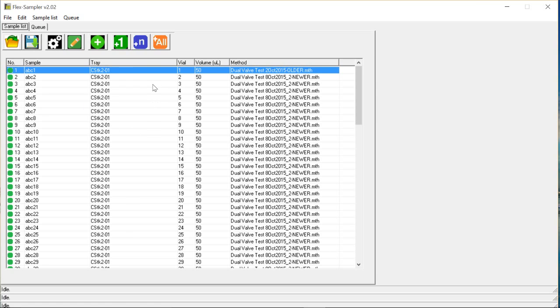And that's about it. It wraps up our Flex Sampler version 2.02. And we're constantly making improvements, so please check back with us for more.